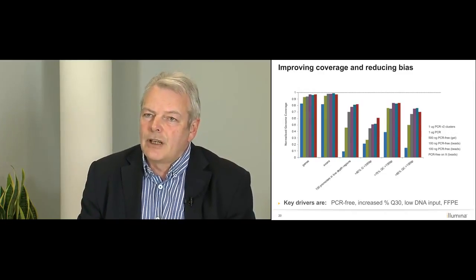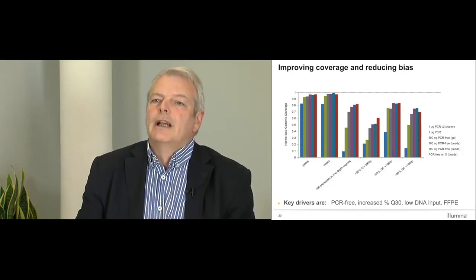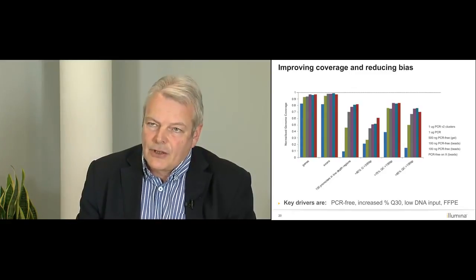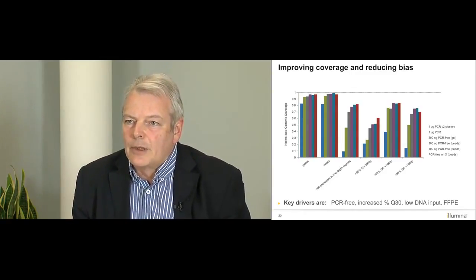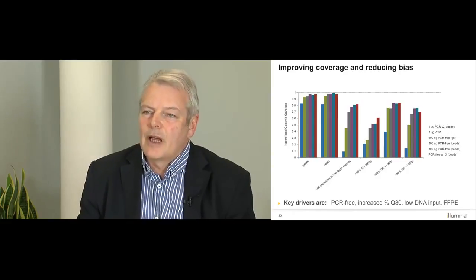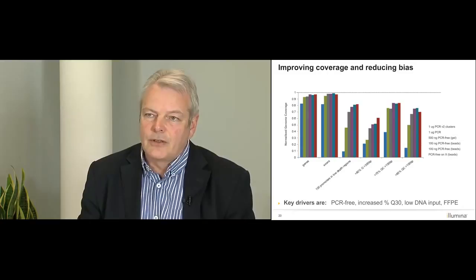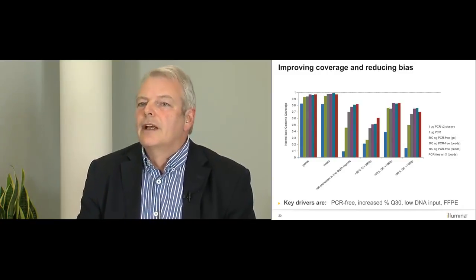So they're coming much closer to the normalized 1, which you see at the top of this plot. 1 means that if you build a 30x genome, you would get, on average, a 30x representation of that particular feature. So you can see, for example, the very high GC-rich ones, they're not up to 1 yet, but they're getting close to 0.7 times what you would expect from a random sampling. And so this is very encouraging in terms of getting really good coverage across most of the genome. But it's an area that we really look at, particularly these difficult areas.